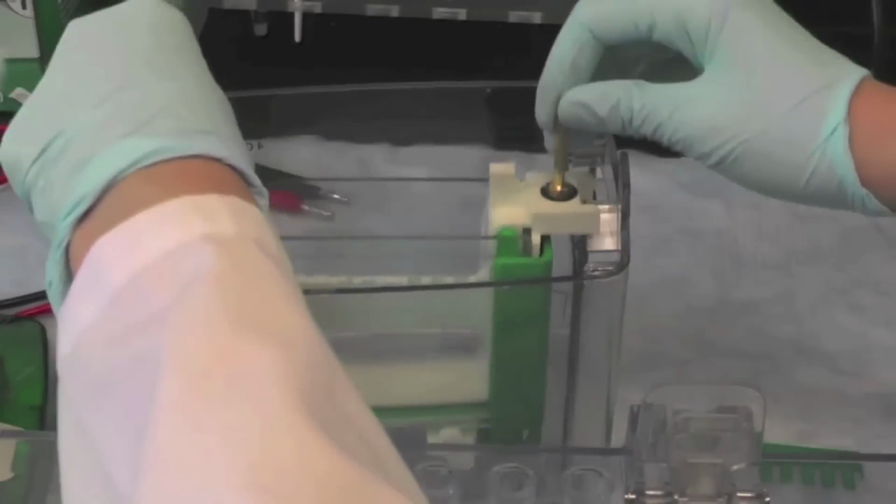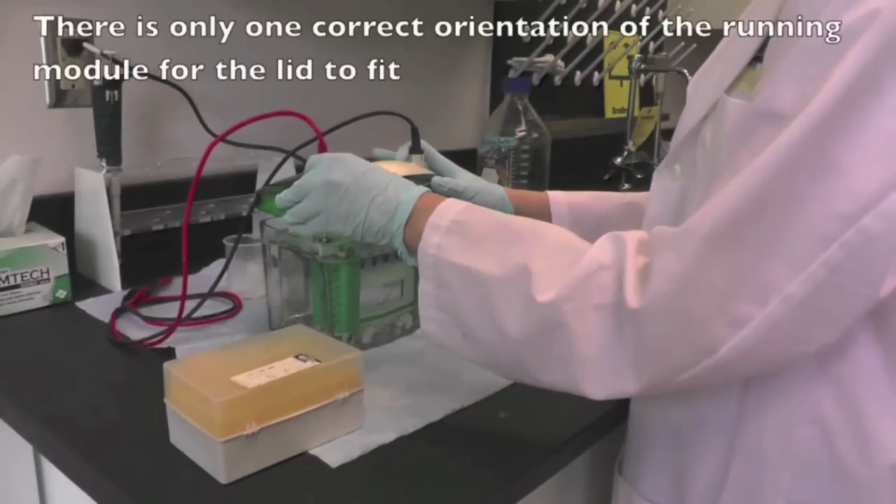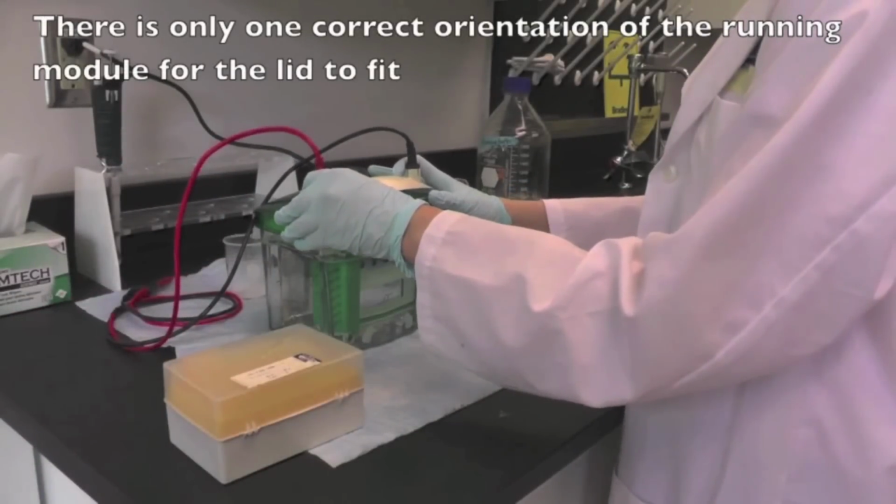Insert the running module into the tank. Make sure the module properly inserts into the slot in the tank. At this point, check to see if the lid fits appropriately.